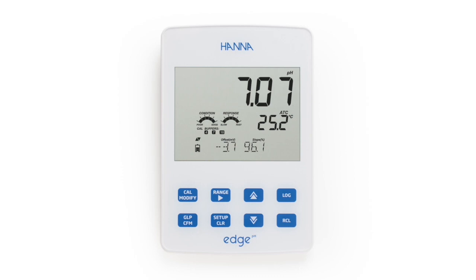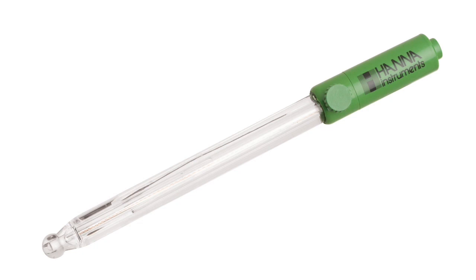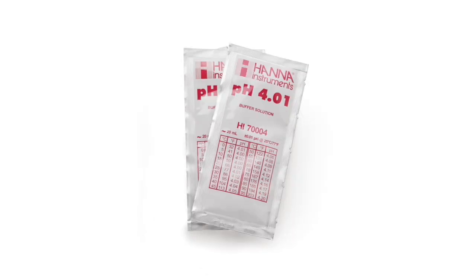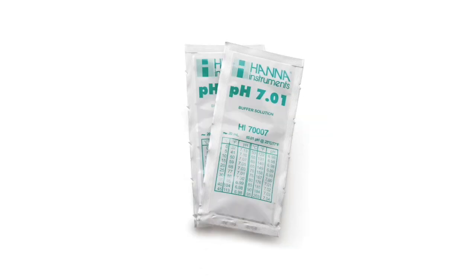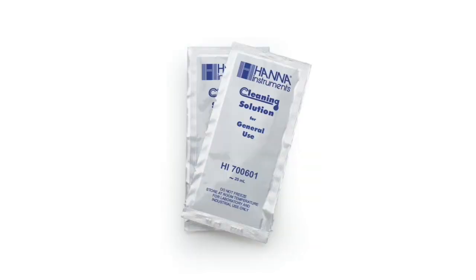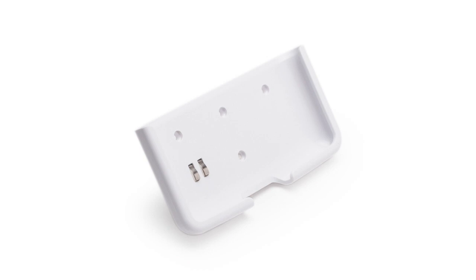Along with the meter, you will receive the following: the HI11310 combination double junction pH electrode, bench top charging cradle with electrode arm, two sachets each of pH 4, 7, and 10 buffers, two sachets of general purpose cleaning solution, and a wall mount charging cradle.